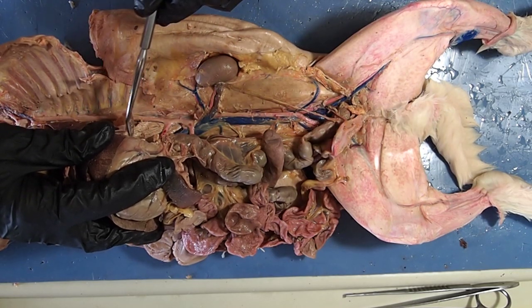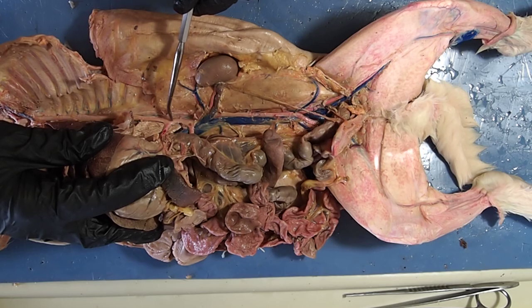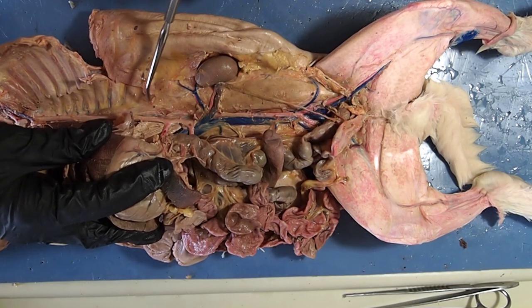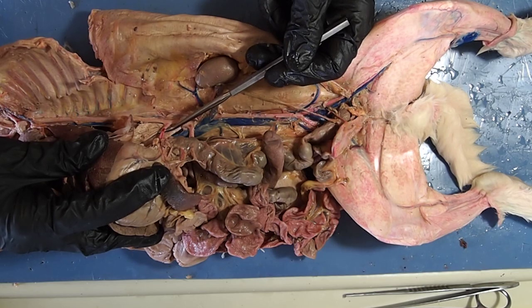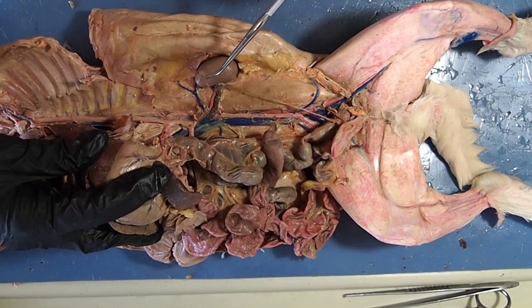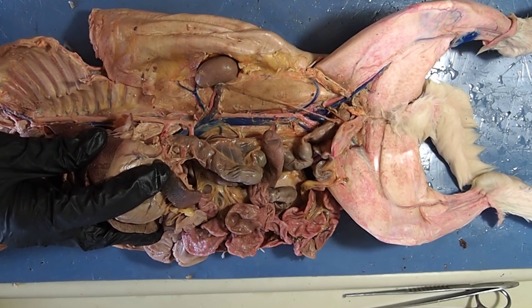We pick up our aorta here down past the diaphragm, and we call this the abdominal aorta from here on down until we see this little V right here. If we follow that abdominal aorta through the diaphragm, notice these two large blood vessels. We now have to supply all of the lower part of the body with blood and also collect it and send back the deoxygenated blood to the heart.